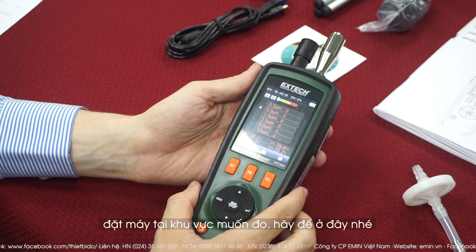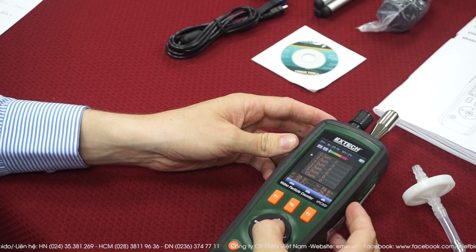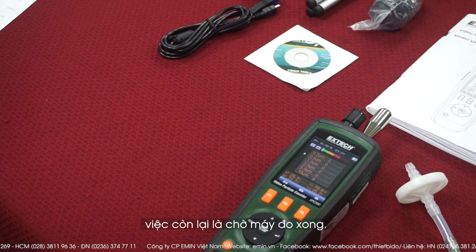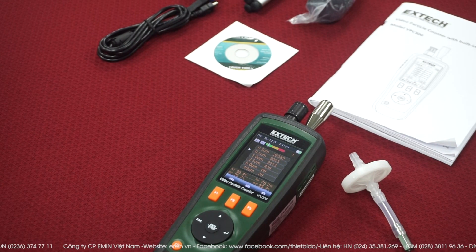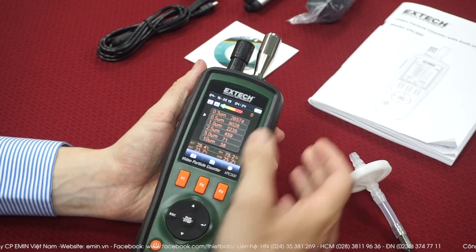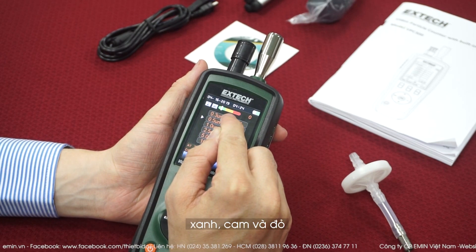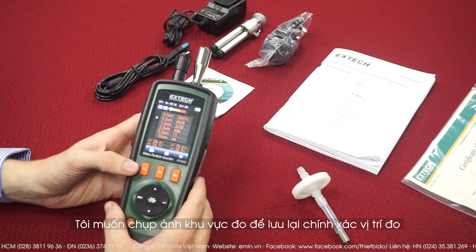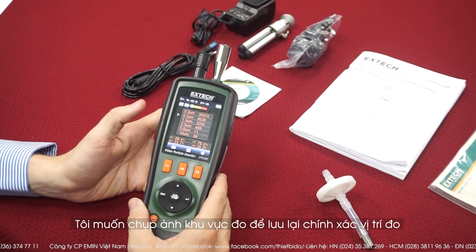I put the tool in the area I want to measure, and I run the test. Now I wait for it to be done. The test is done and here we have the different results. You can see three colors — green, orange, and red — indicating the air quality level. Let's say I want to take a picture so I remember exactly where this measurement was made.